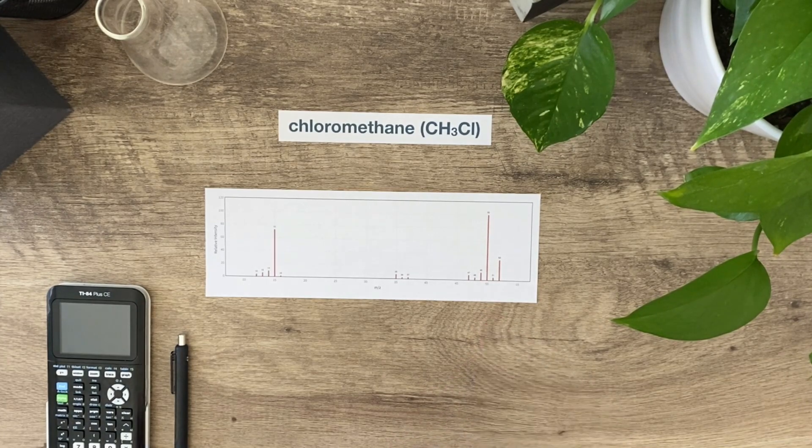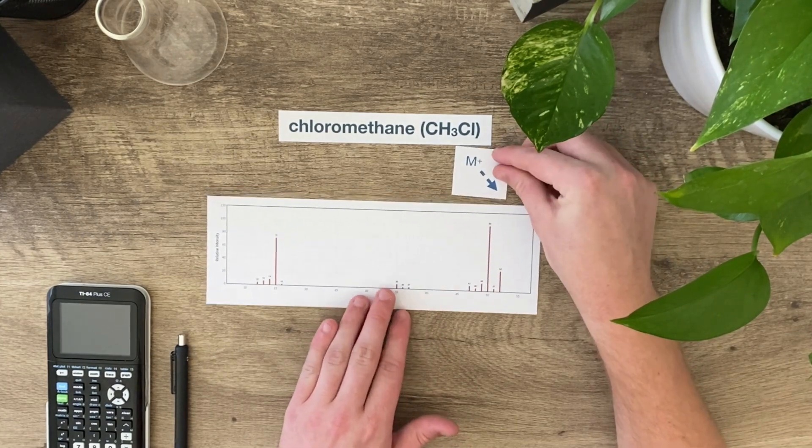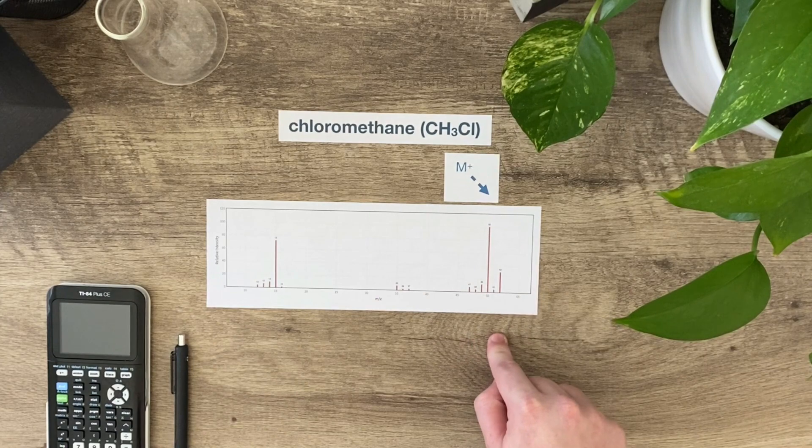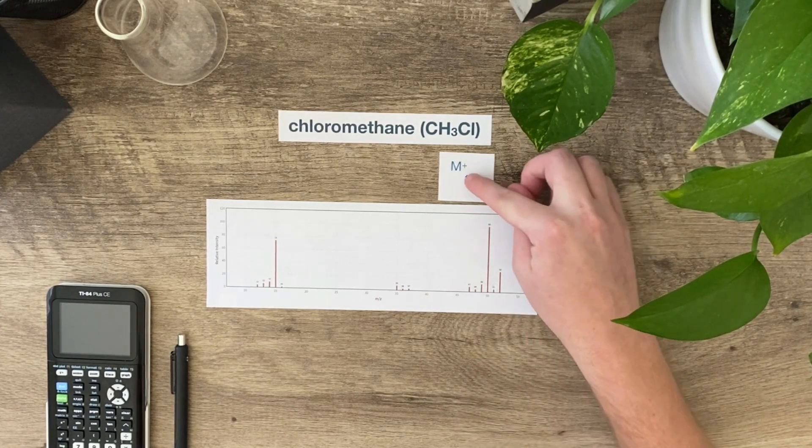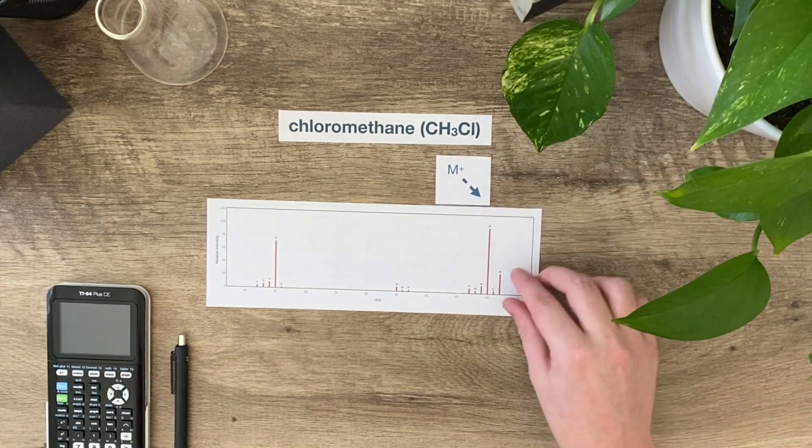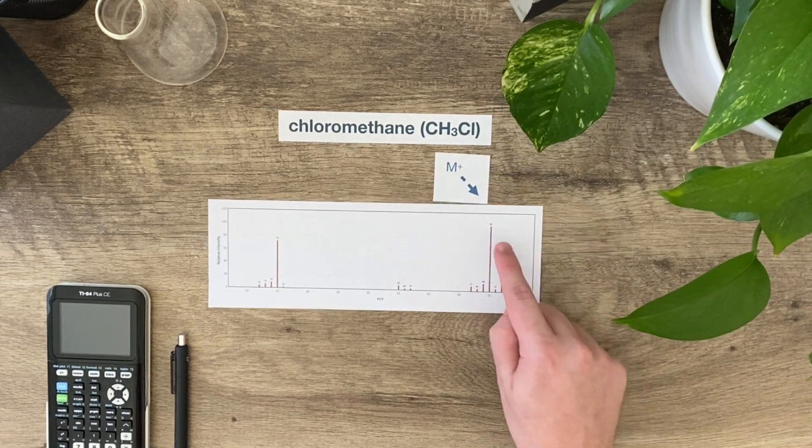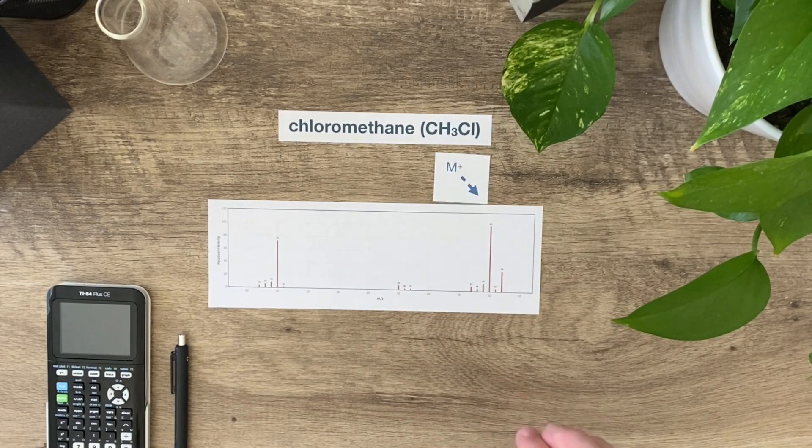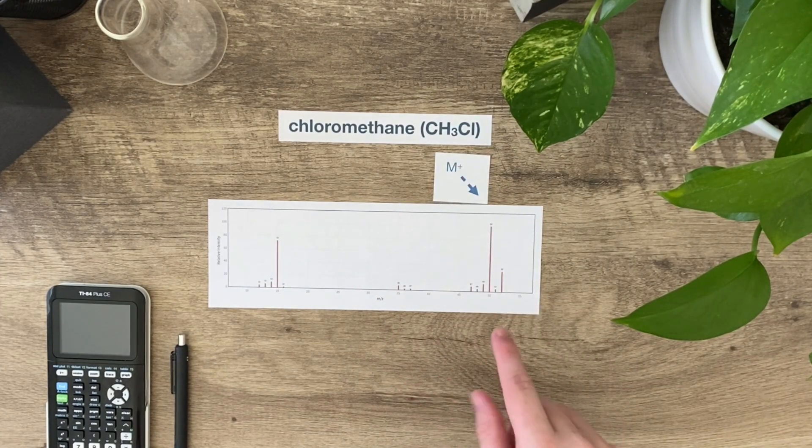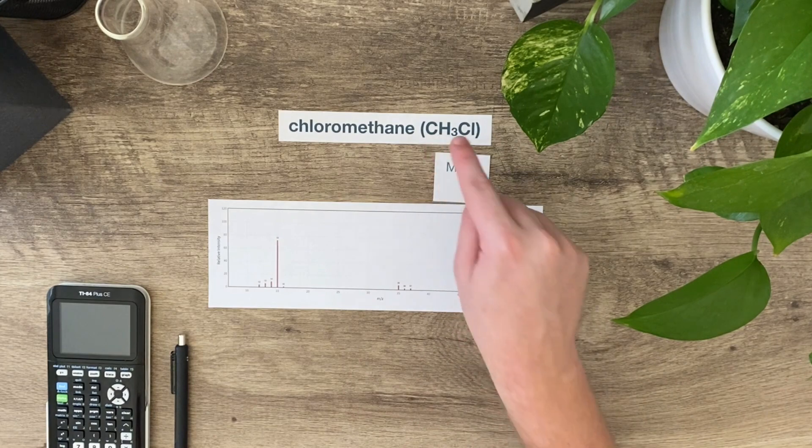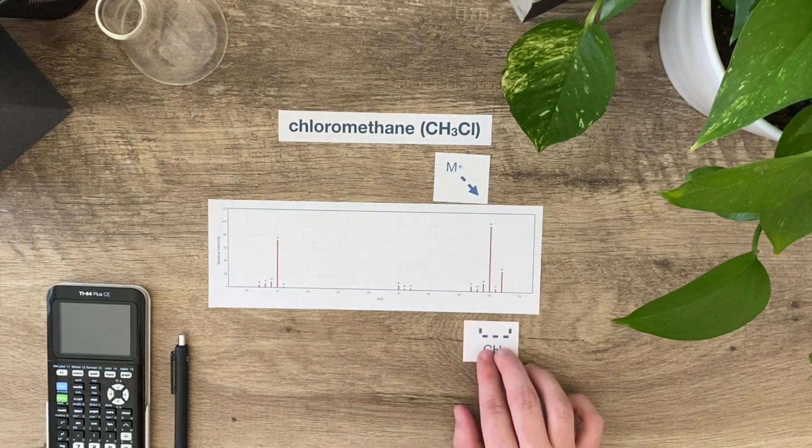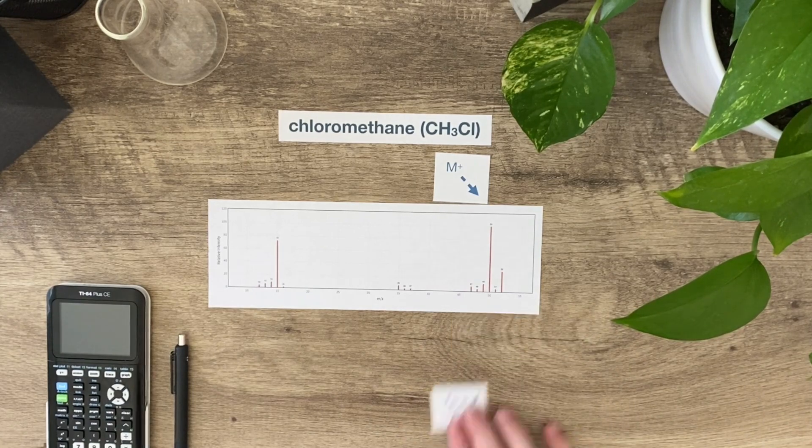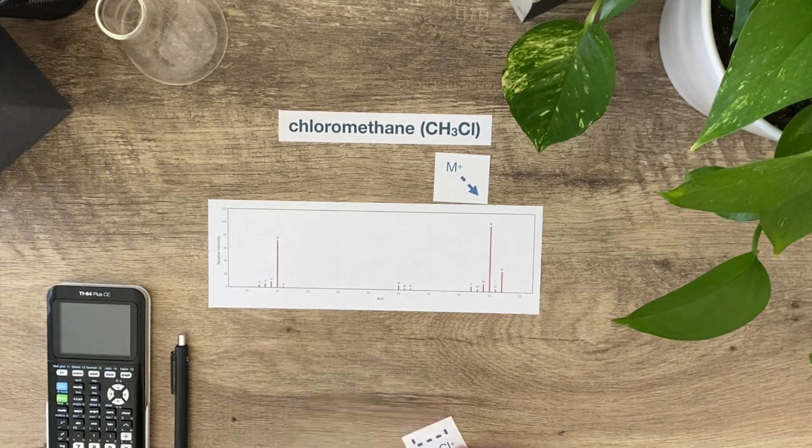We haven't named this yet, but this high peak over here at 50 is called the M+ peak. It's the molecular ion peak, which is the mass of the molecule not broken apart. So 50 here is corresponding to this entire molecule stuck together, and these other variations are just different isotopes of CH and Cl, which is why I have a little bit of variance associated with these peaks.